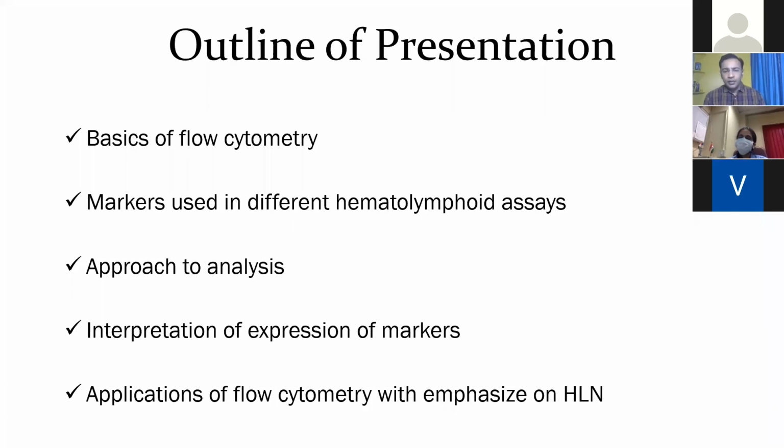And then we'll go through one or two examples with different applications which are commonly used, because the scope of this topic doesn't include a detailed discussion of all applications of flow cytometry. So we'll be covering the common applications which we come across in routine practice.